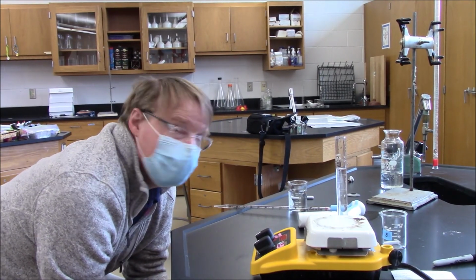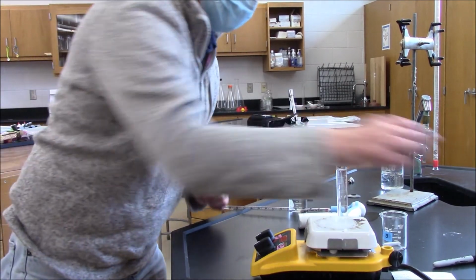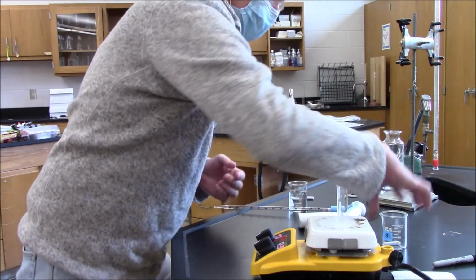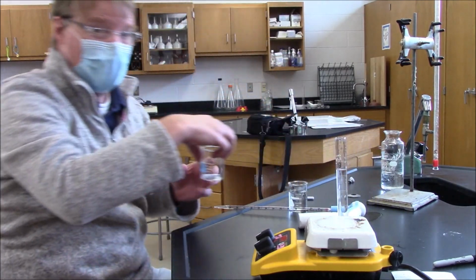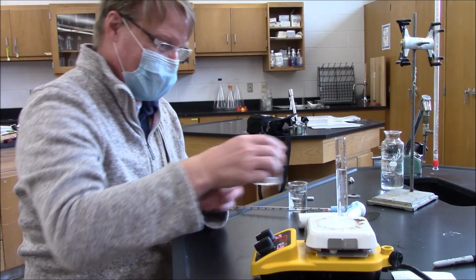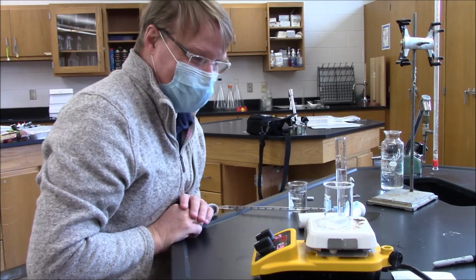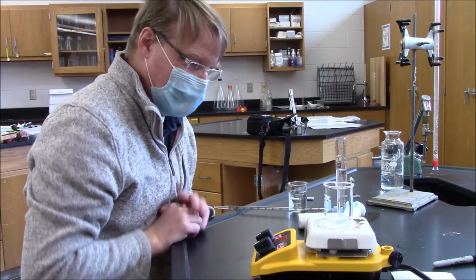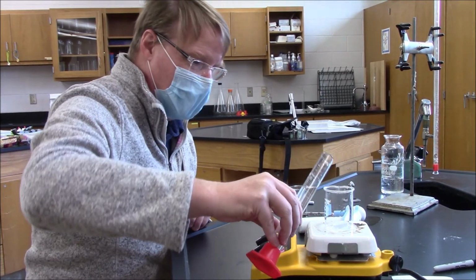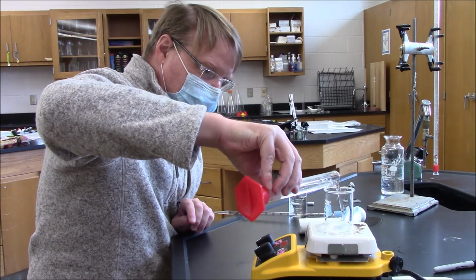Can you take that beaker with the number 3 on it? Oh, the beaker. This one. Okay. All right, please take what was in the cylinder that you just measured and put it in the beaker. Without spilling it all over the floor. Yeah, we're good.